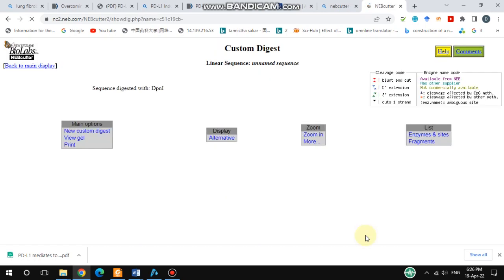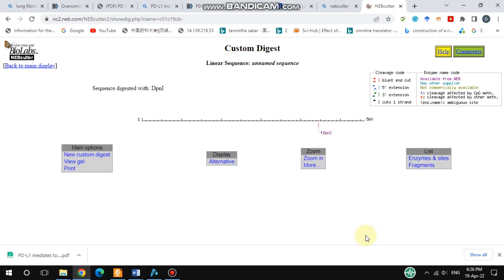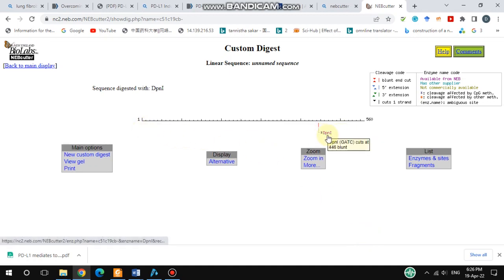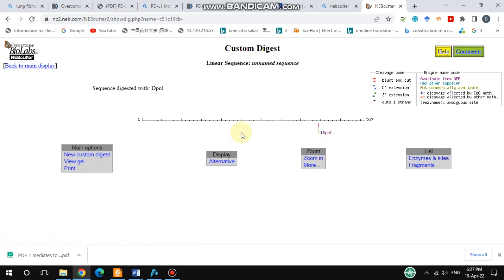After digesting, it shows that DPN1 cuts at position 446, and the cut will produce a blunt end at the GATC site. If you would like to see the gel result, hit the View Gel button.